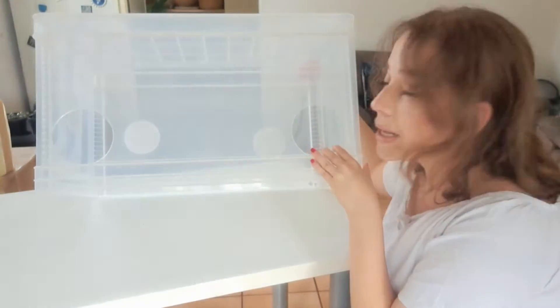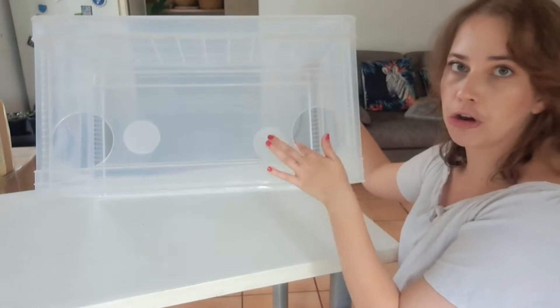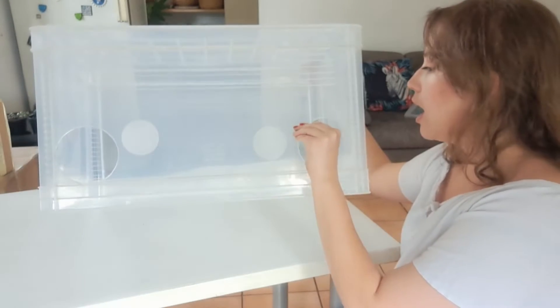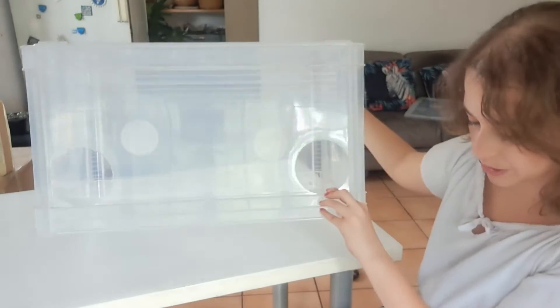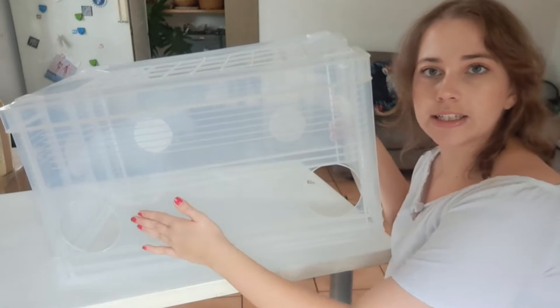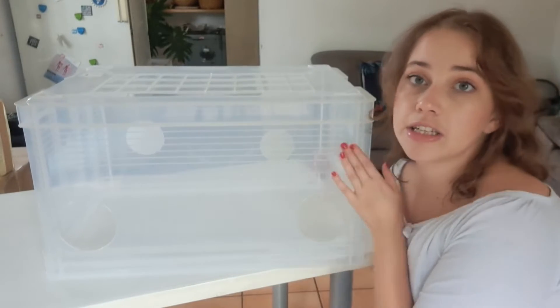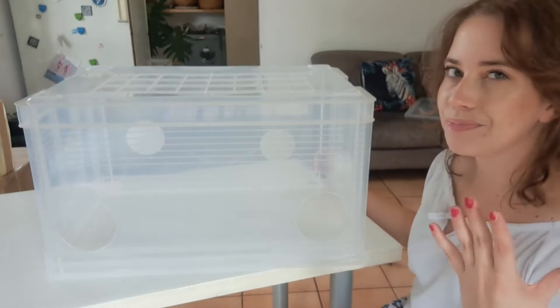These holes were melted in — you heat up a circular metal thing and press it in to melt the plastic. I'm sure you could drill it, but you'd have to sand it down so it doesn't scratch you when you're working. If you have one with holes closer together, please let me know how it works for you and if it's easier, because I've heard people say it's better but I wouldn't know since it's my only one.